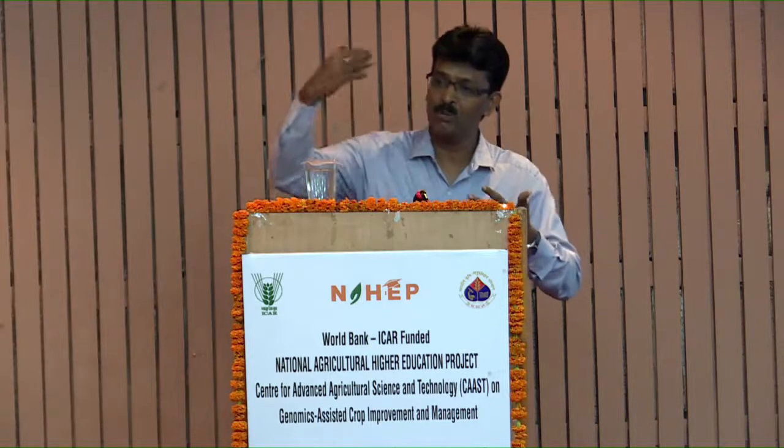So what I mean to say is there is a progressive multiplication. 1 becomes 2, 2 becomes 4, 4 becomes 8, and it goes on and on, right? So it is popularly estimated as 2 power n. At the end of the day, n is equal to the number of cycles, correct? Isn't it?